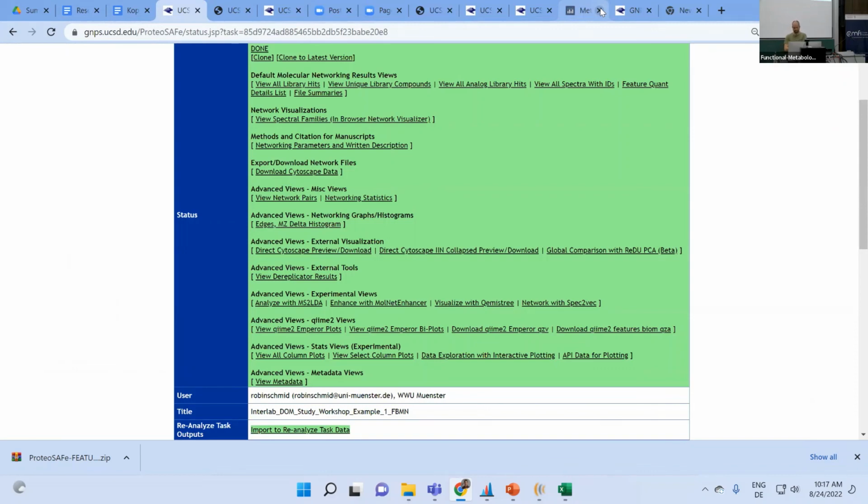Exactly. Yeah. So that is what we take out of it as the main take home, right? I want to get network connectivity between the features of my feature table and annotation. And that's at the end all we take, and we move on from there, and then we add SIRIUS and MS2LDA on top, right? And then what we need is just the feature number as our anchor that connects it, and that is given from your output table from MZmine yesterday.